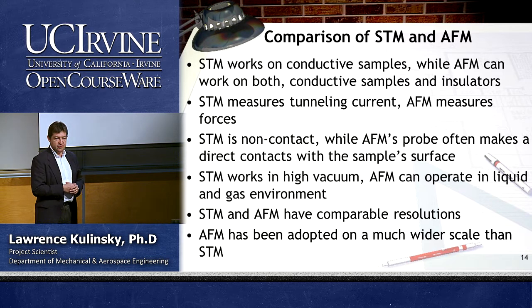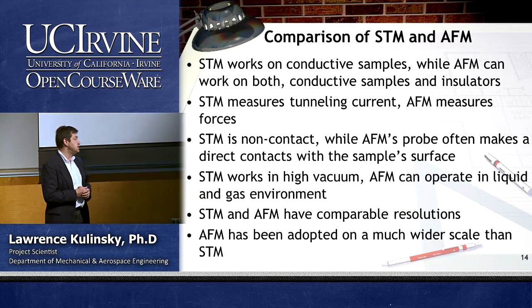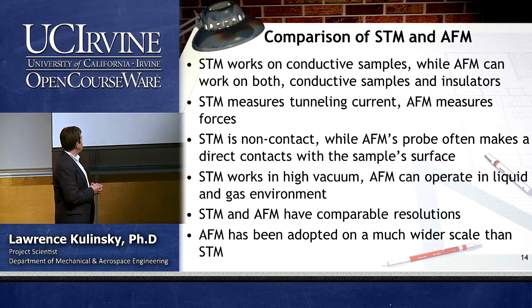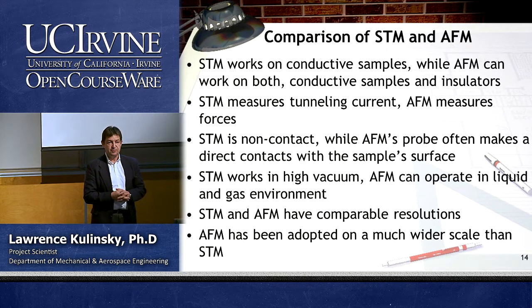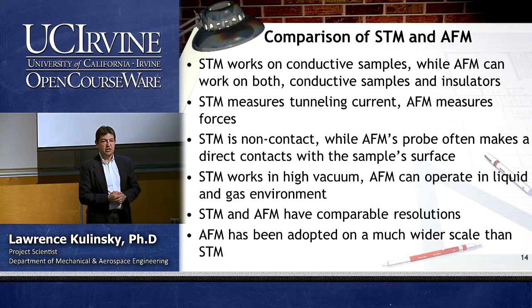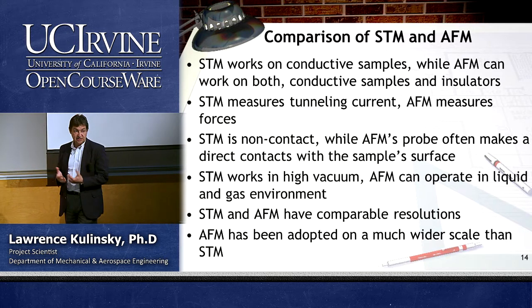And for another reason why STM is so cool, we will touch on it later in this lecture. And as a result, AFM has been adopted on much wider basis. So now more universities and corporations have AFM than STM, even though AFM was invented, as we discussed, later.